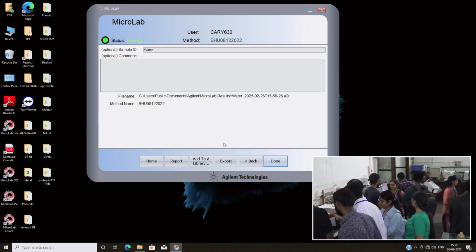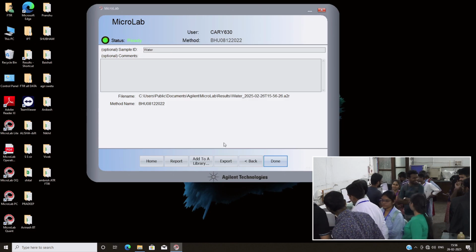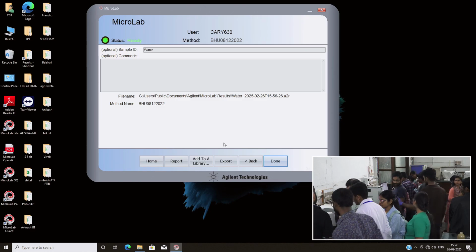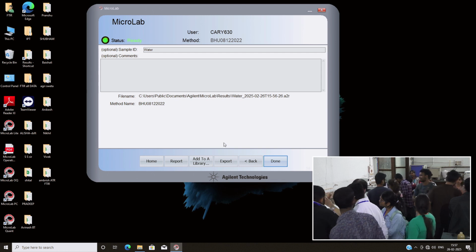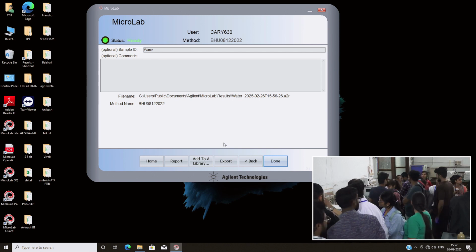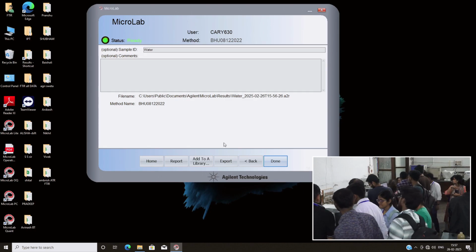The path length depends on the wavelength. So it's okay to identify the peak position, even if the intensity is distorted.